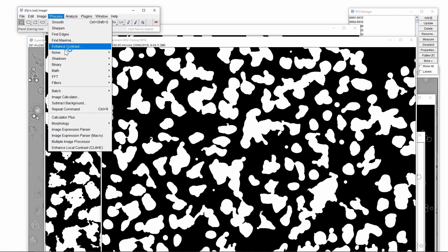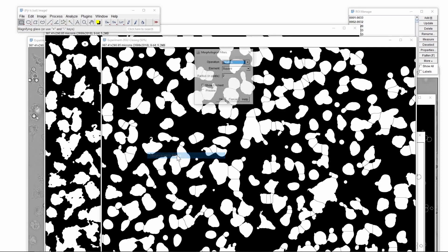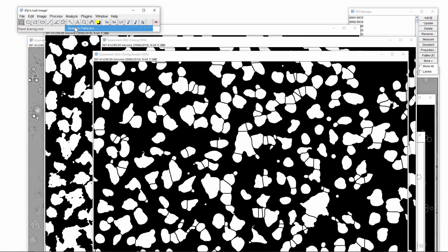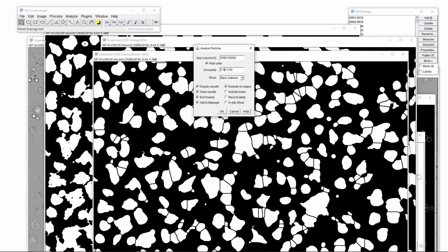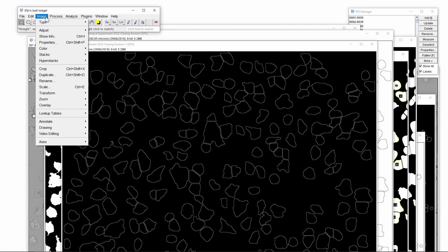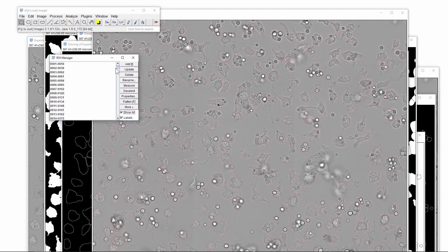We repeat the remove outliers procedure but now with a 20 pixel radius. Next we will separate the clustered macrophages using the watershed algorithm. In order to separate the macrophages better we will use an erosion step with the disk element and radius set to 2 pixels. We then use the analyze particles command, setting the minimum size to 3000 pixels and the circularity to 0.1, because macrophages are not as circular as the spores. Finally we create an overlay image by inverting the outline and using merge channels with the grey transmitted light and red outline. The result is the overlay image plus a region of interest list of the individual macrophages.